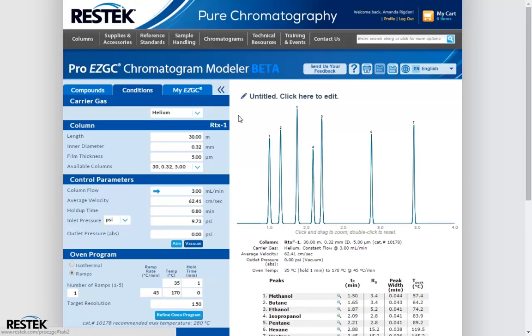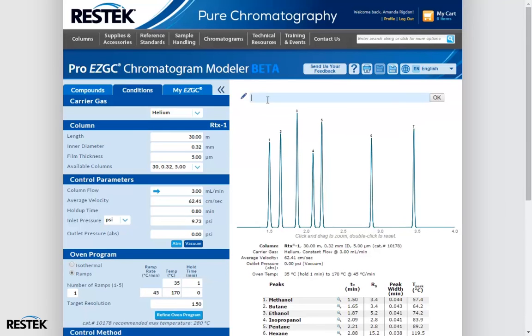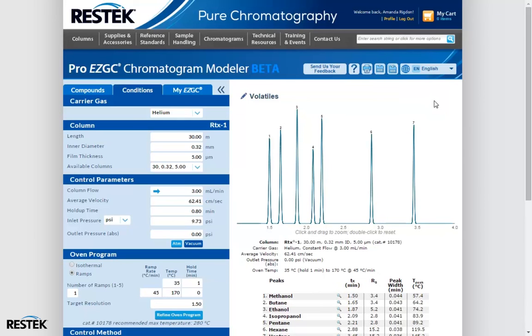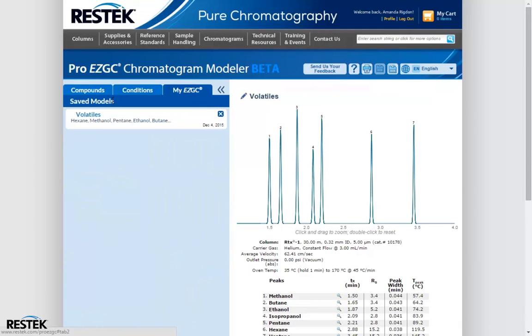Once we have a model we like, we can give it a name, hit OK, and save it for future reference. All of our saved chromatograms are saved to the MyEasyGC tab. Once we have a lot of chromatograms in here, it's very easy to switch back and forth between them, compare and contrast, or just save them for future reference.